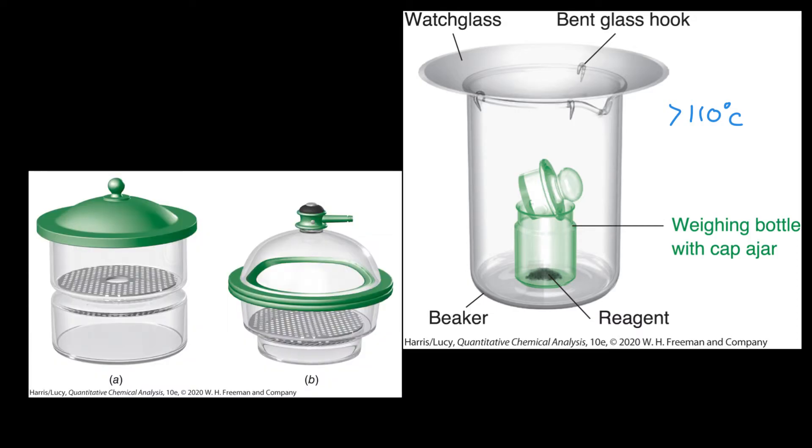We use a piece of glassware called a desiccator. There's actually two different desiccators here. This is a vacuum desiccator, and this is a regular desiccator. In our lab, we'll use regular desiccators. What we need to do is put our sample inside that is still warm.